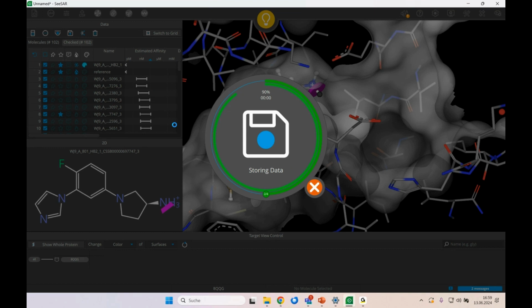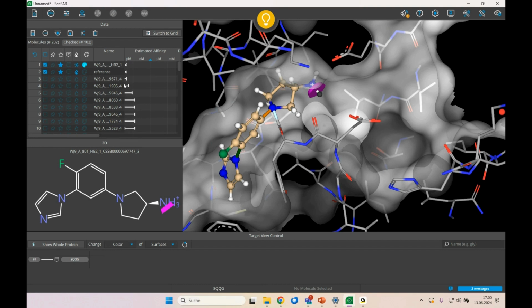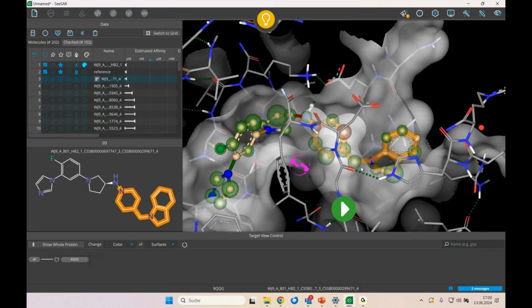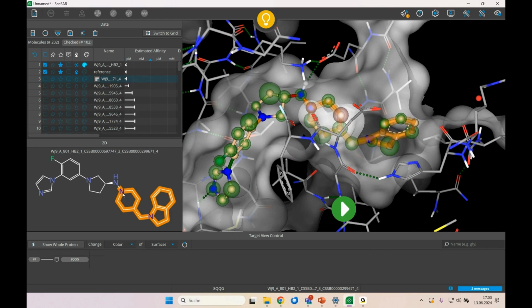And after that, I would like to do a quick and dirty covalent test. Really quick and dirty, just to get ideas. So, okay. This would be the new proposal. Again, a little bit of nitrogen, but with a pharmacophore constraint, this is something we could actually solve maybe. And in this case, we are also somewhat able to project into the allosteric binding site there.